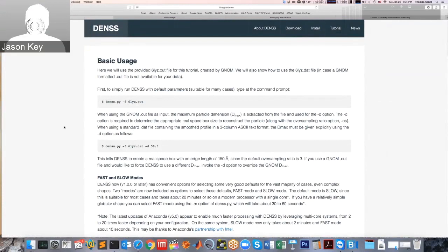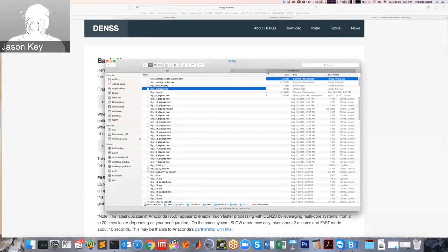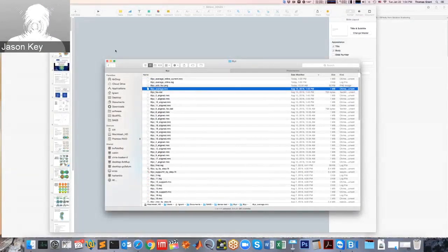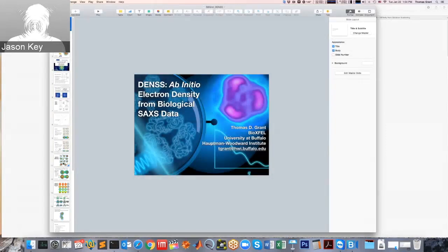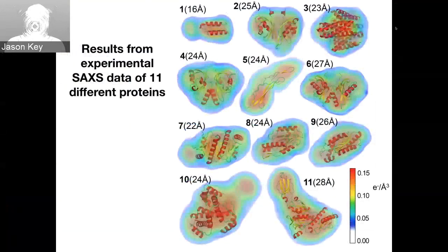One other thought that came to mind when I saw your envelopes that had crystallographically determined models that were missing domains or termini is that this would be a phenomenal complement to crystallographic structure determinations, even for molecules that are, let's say, large complexes at 3-ish angstroms, where people are trying to find the domains and they're not even totally sure that they're in the crystal.